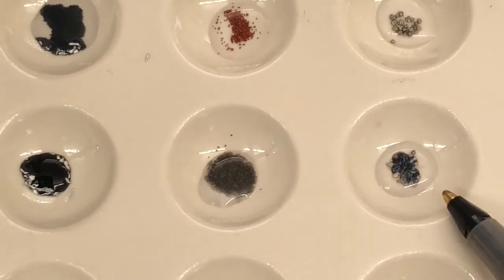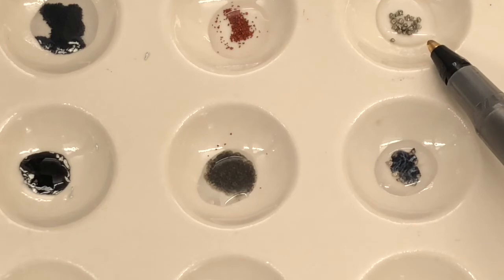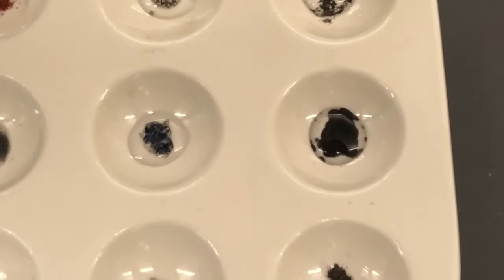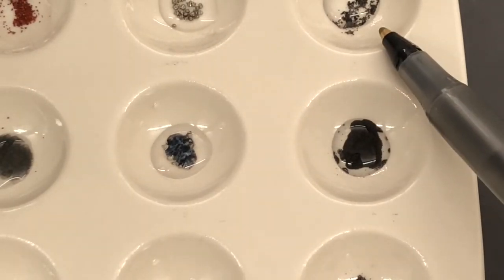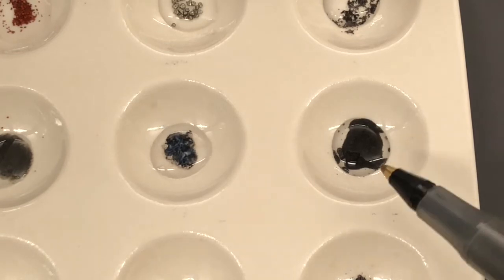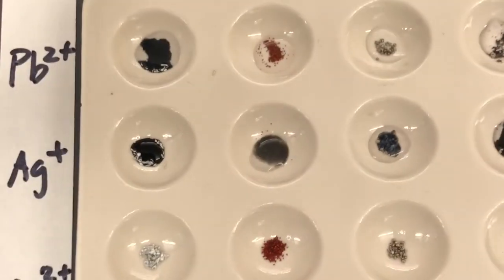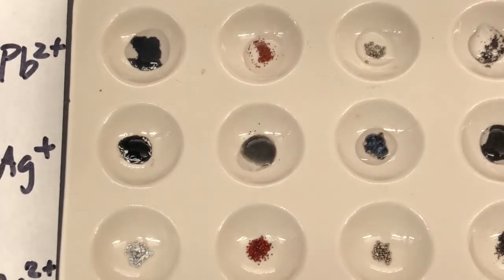When we look at the tin with silver 1+, again, contrasting that with the previous example, you're starting to see this black coloration forming. And then finally, when we move on to the iron, unlike some other examples where it was hard to tell whether or not something happened, here we see big black blobs forming in this solution as the silver is precipitating to silver metal. Okay, so that was a pretty exciting set of rows to look at.